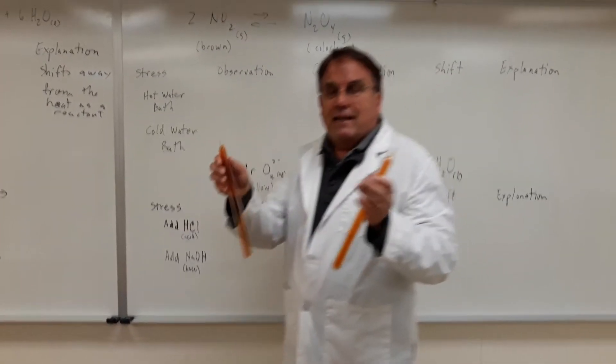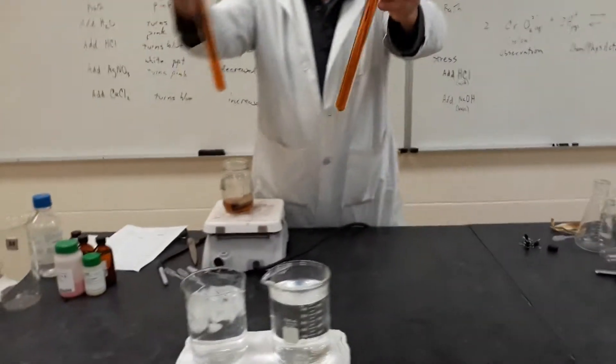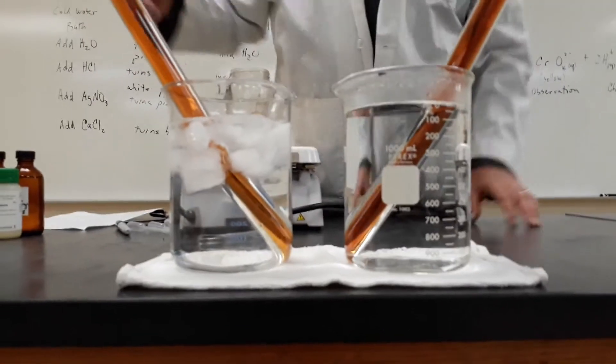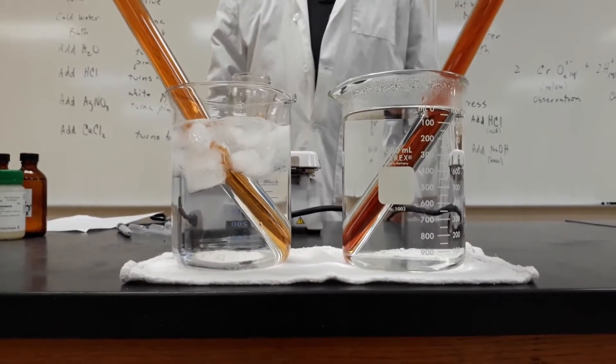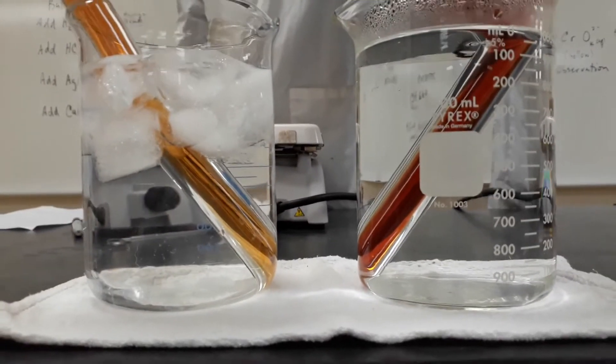Now we want to figure out is it an endothermic or exothermic equilibrium. So we'll take these two identical tubes and we'll place one in a hot water bath and one in a cold water bath, and instantly you see an immediate difference. And if you zoom in close, you can see the gas here volatilizing.